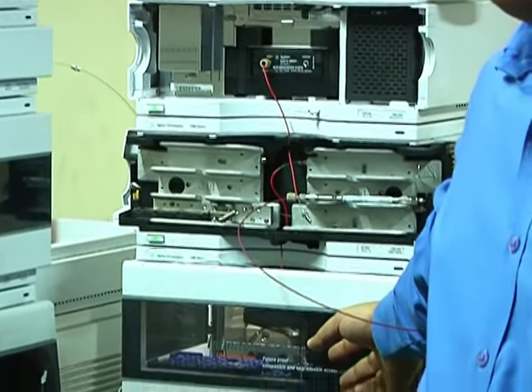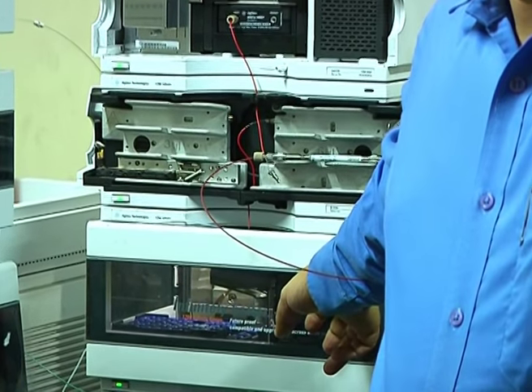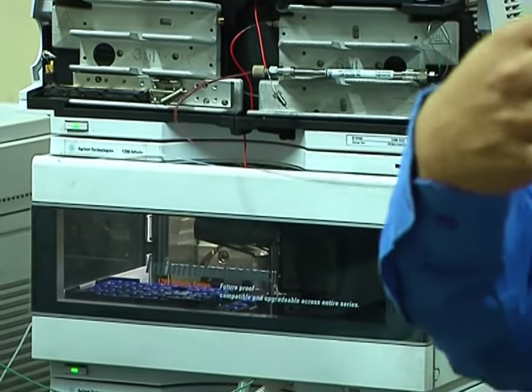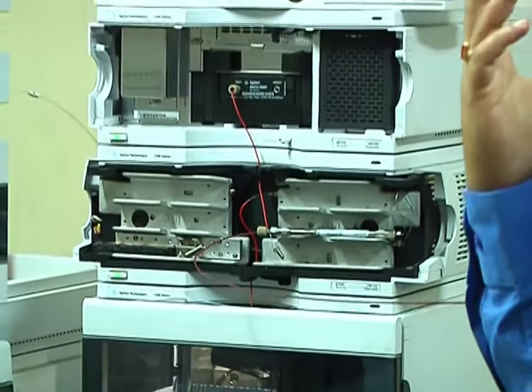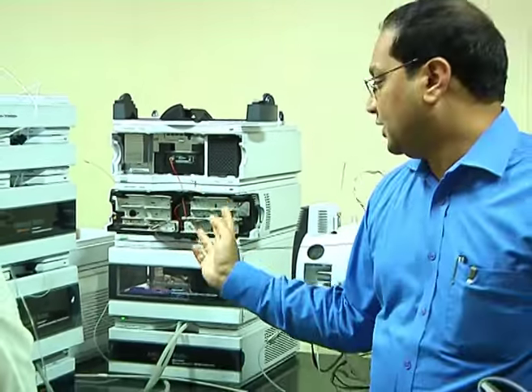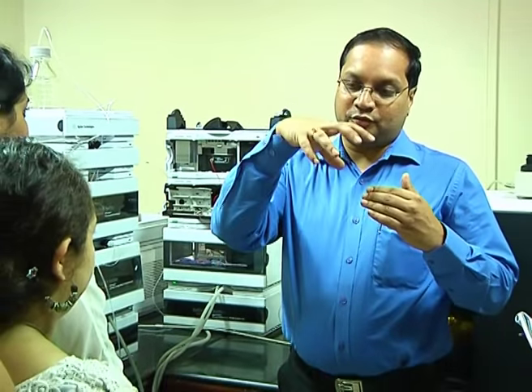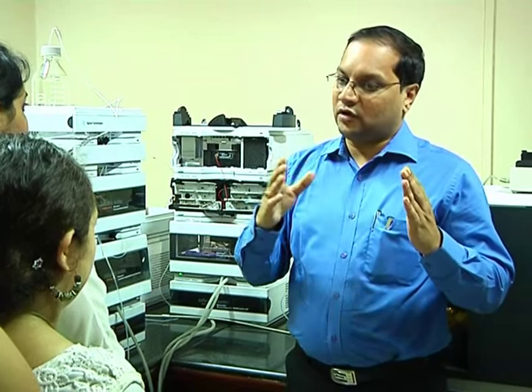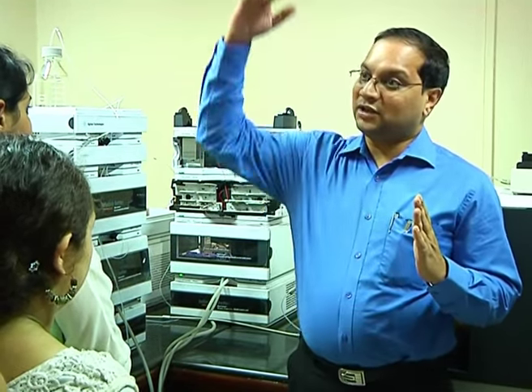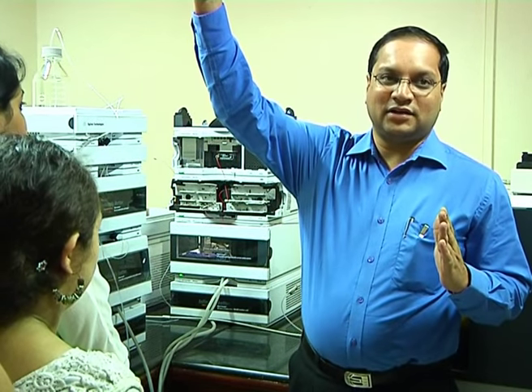Then you have an autosampler. If you recollect my slide where I said it can be automated, you can put hundreds of samples in it. You define your runs, and you can carry out your other work, and by the time your analysis gets over, it is automated. What I mean to say here is, if you put 100 samples and the run time to separate is 30 minutes, let us say, by the time the 100th sample comes, it is 300 minutes, isn't it?